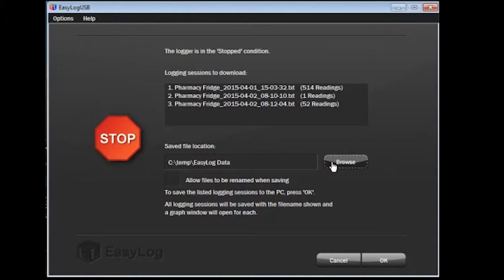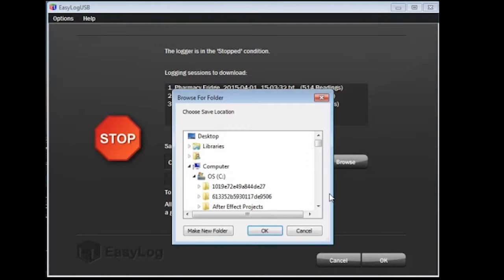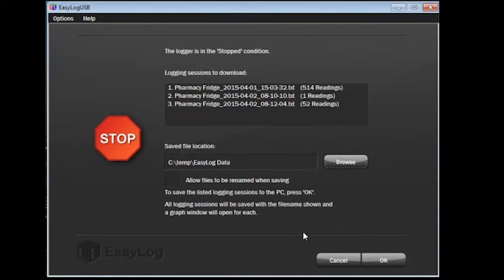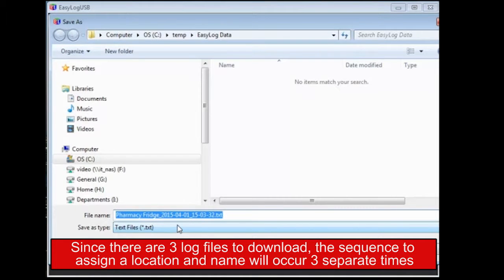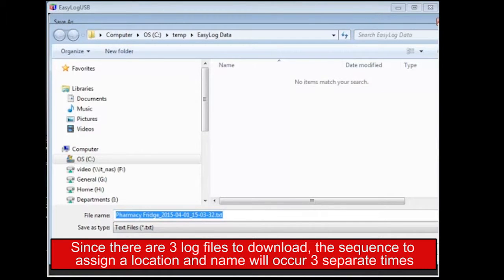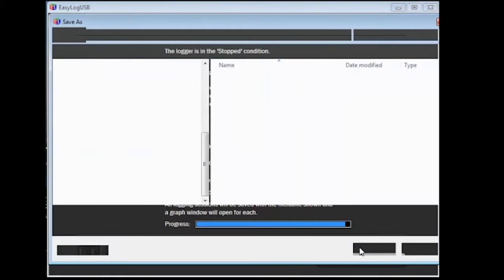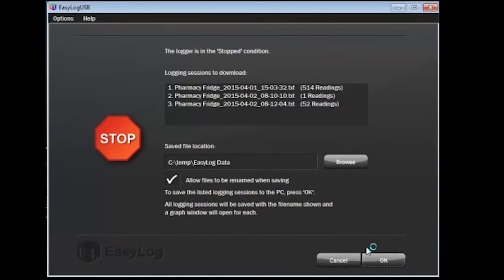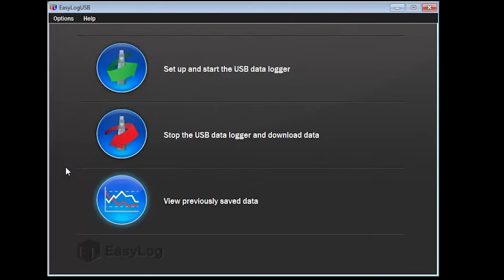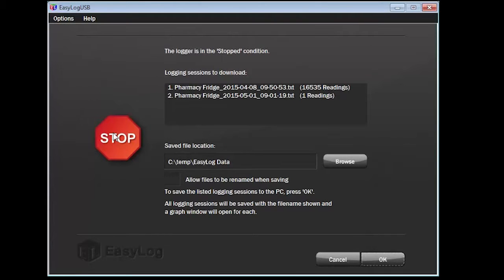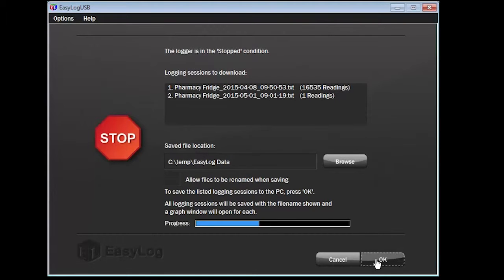Looking further down, you see the location where the logging session records will be downloaded to. Click on Browse and you can select a new location to save. Below that, there is a box you can check to rename the files as they are being saved. I will check the box so you can see what will happen. Click on OK and the Windows Explorer window will appear at the location you wish to save the records. I am going to keep the file name as it is and click Save. Since there are three different logging sessions, I will need to perform this routine for the next two sessions. After saving the third logging session file, the Easy Log Graph will appear after a few seconds.